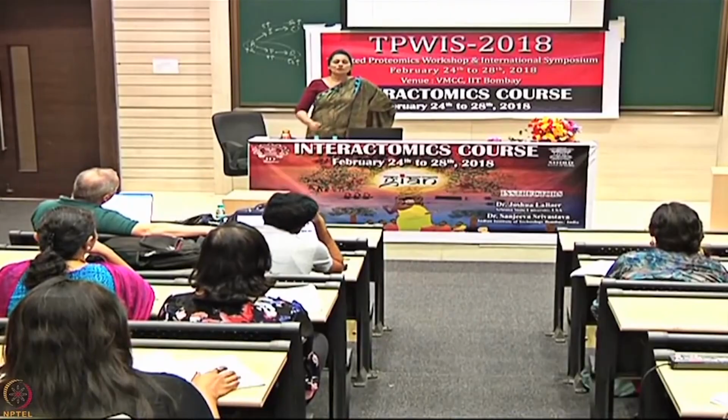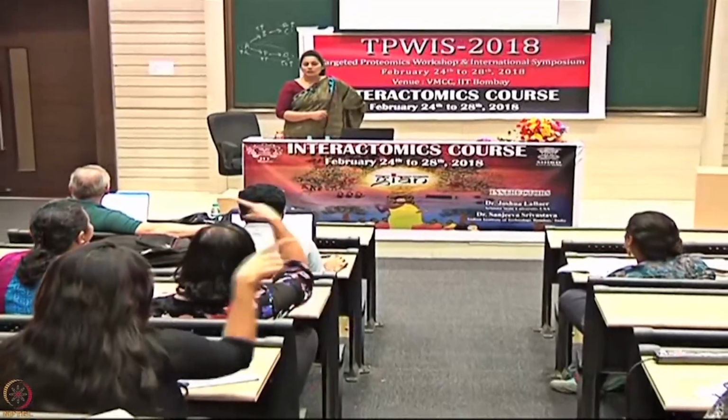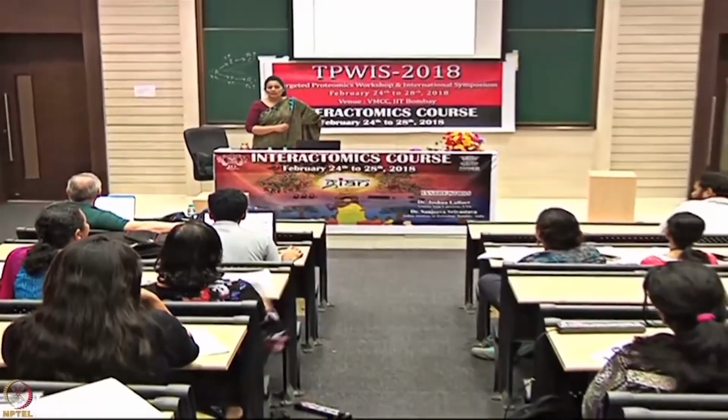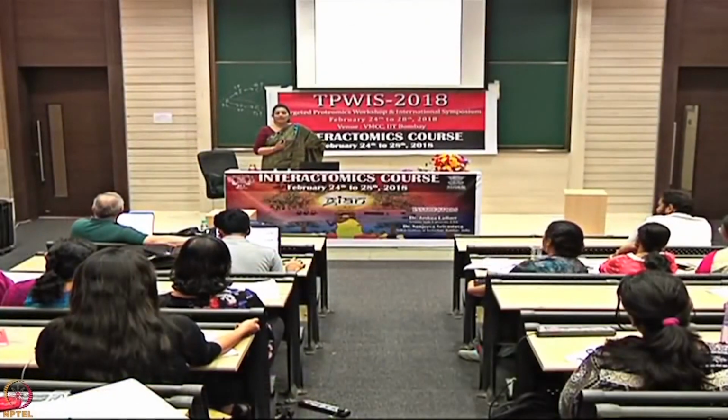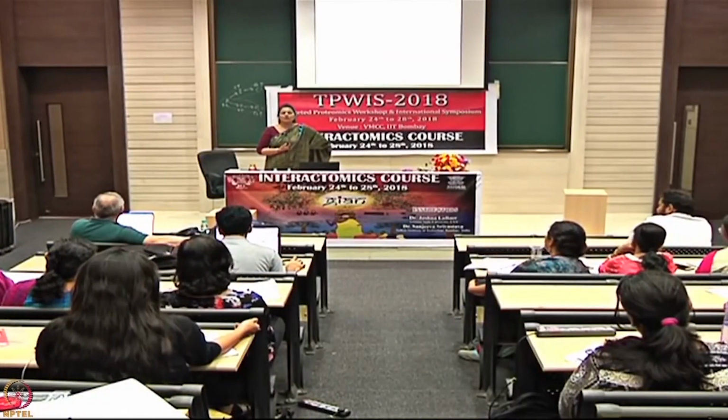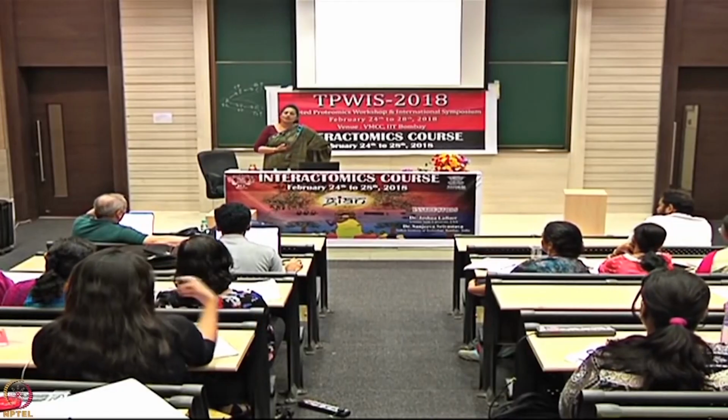So I'll keep it for 3 days. No. Okay. Yeah, but then imagine over the days it will come like this, okay? It will definitely come, but that's not the point. So what should I do now? I won't get a good off rate from this, so what should I do? And without the off rate, my kinetic estimations are not going to be right.